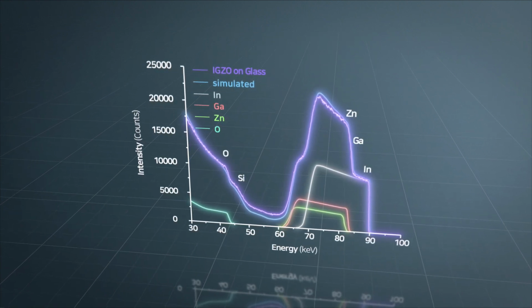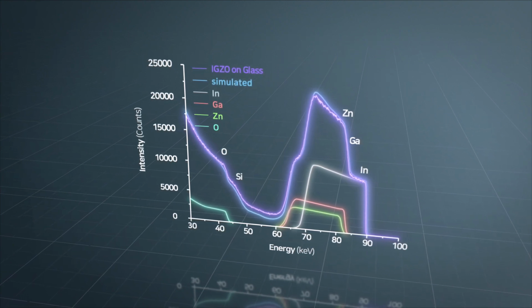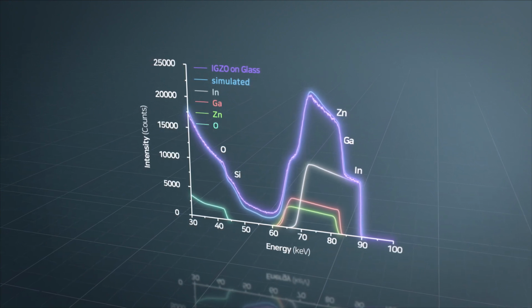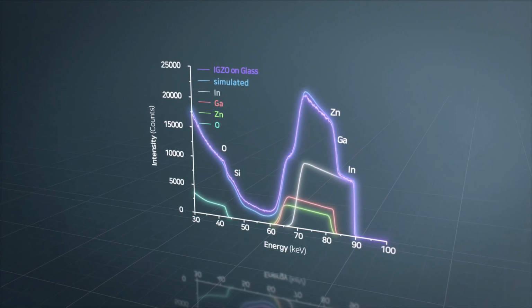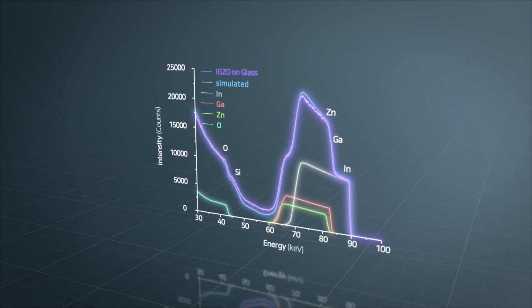It is a transparent oxide material comprising indium, gallium, zinc, and oxygen. The properties of IGZO can be modified by adjusting its composition and thickness. Therefore, an accurate analysis of the composition and thickness is important and can be achieved using MEIS measurements.